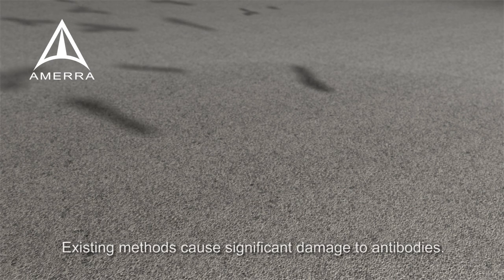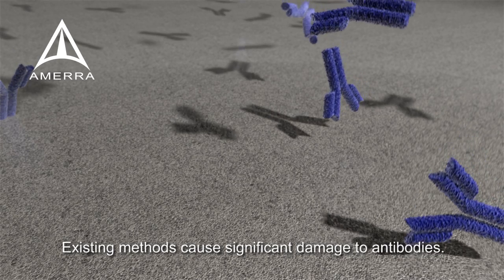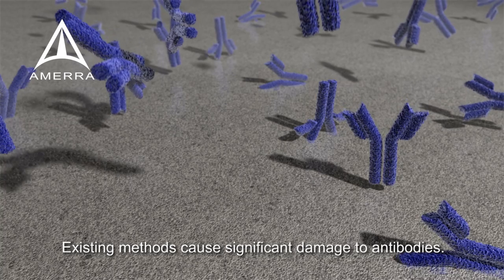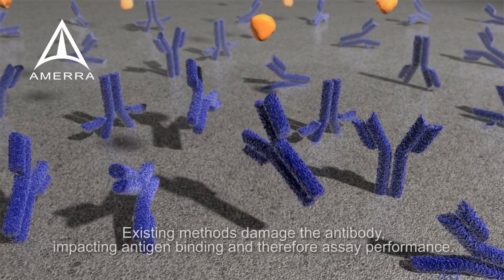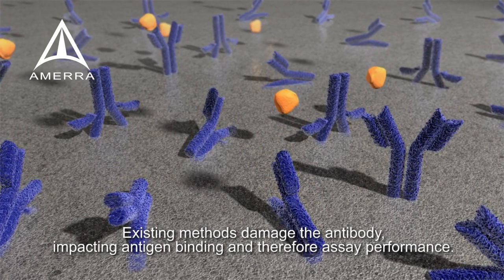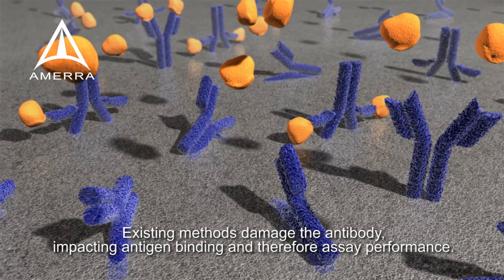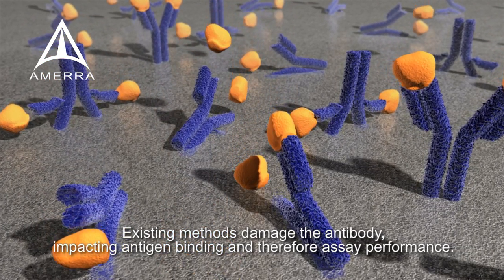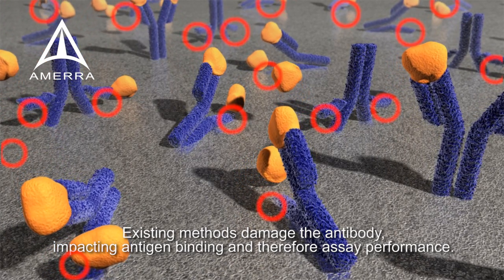Let's start by talking about existing methods. These methods of immobilizing biological materials onto a synthetic surface lead to random attachment and create significant damage to the antibody's FC region and with that to their binding sites. This irreversible damage occurs because those synthetic surfaces are not compatible with biological materials such as antibodies. As a consequence of this damage, antigens cannot bind to antibodies' binding sites, which results in poor assay performance — for example, reduced sensitivity or the need for a large excess of antibodies in order to achieve optimum performance.